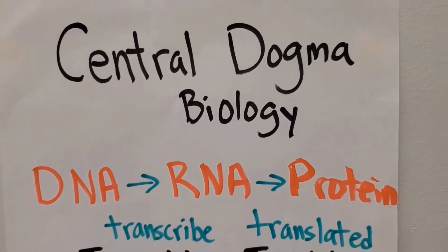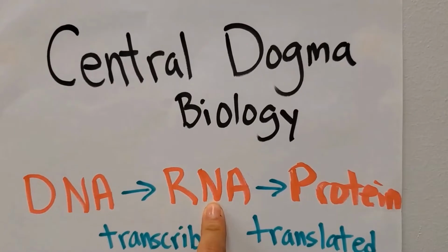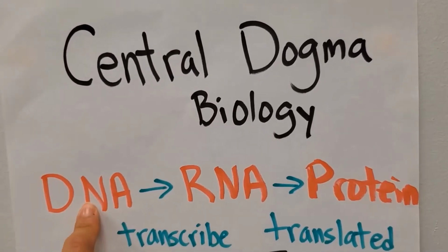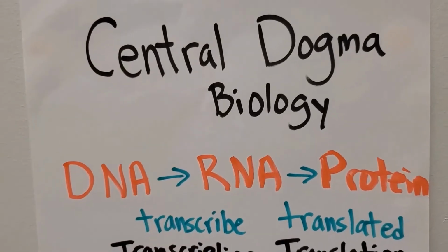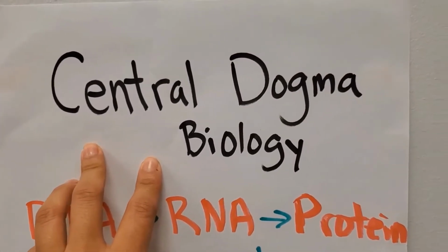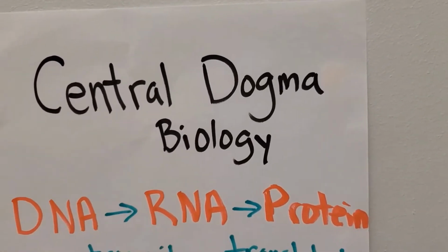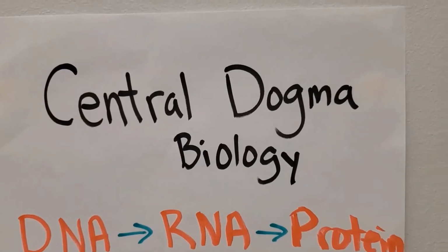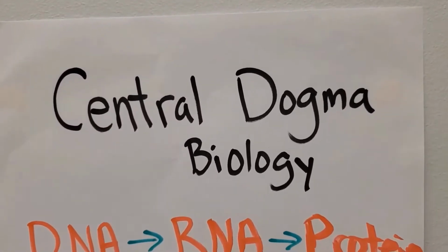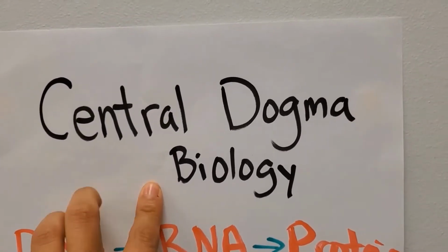In order to understand why we're isolating this intermediate RNA, then doing reverse transcription to make our cDNA in order to do our qPCR, we first need to revisit the central dogma in molecular biology. If you have taken an introductory course in biology or even molecular biology, you have already studied a bit of the central dogma.